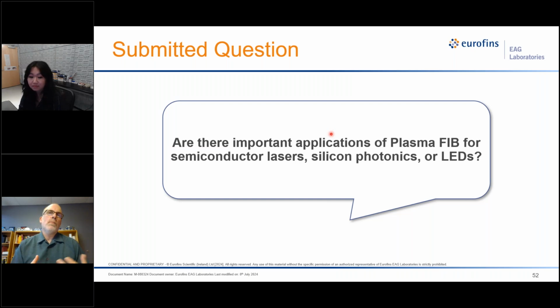Also, as previously mentioned, the absence of gallium poisoning enables things like higher resolution STEM EBIC, where we're working with very limited signals. Typically the FIB induces a semiconductive or conductive surface current path that essentially shunts the EBIC signal away. We want to make sure that all our EBIC gets through the detected circuit. PFIB can really help reduce that and increase our signal-to-noise quite a lot.